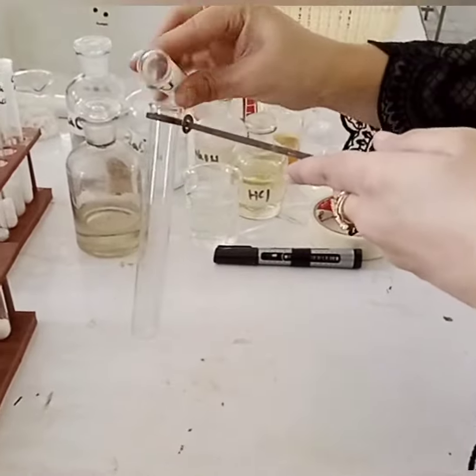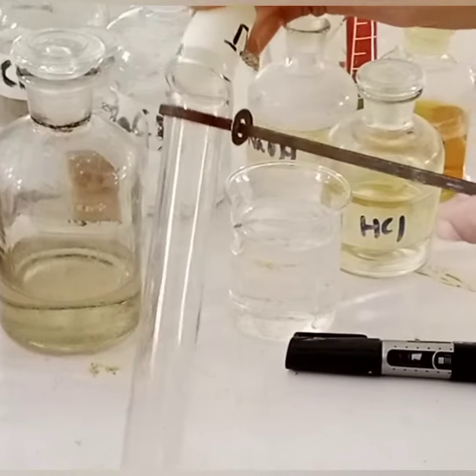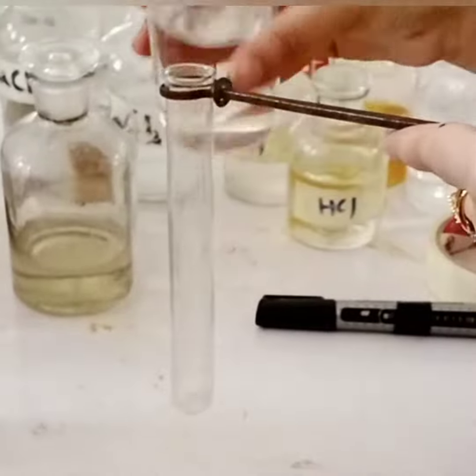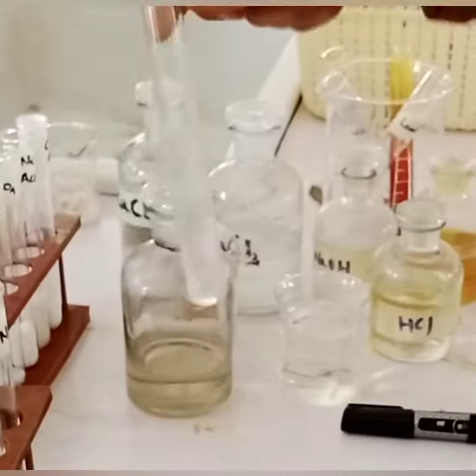Today I am going to perform it practically so that it will be easy for you to perform in your practical exam. First of all, you have to make the original solution of the salt. Original solution is basically the aqueous solution of the salt. Take a small quantity of salt in the test tube and add water to it to make the original solution.